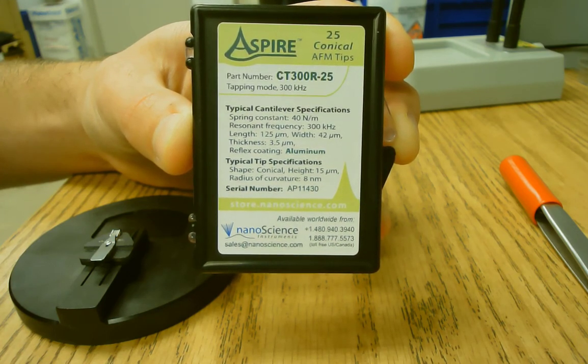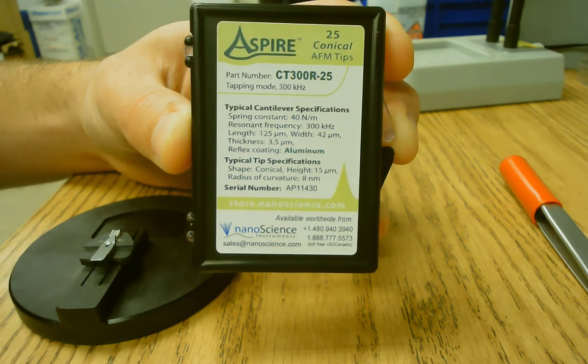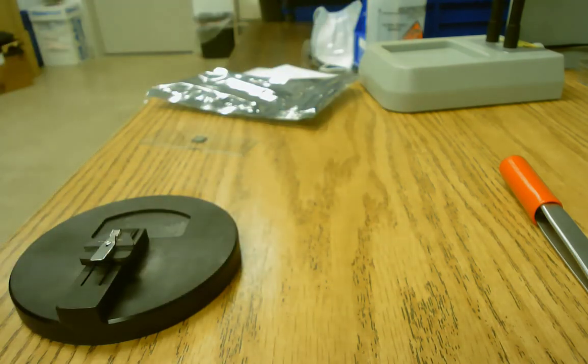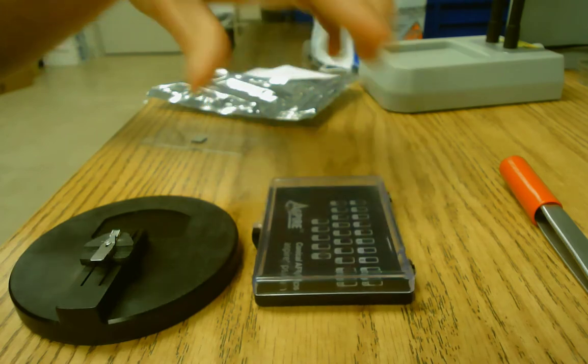And then these tips are specifically silicon nitride. There are just silicon tips as well. The silicon nitride tips are a bit harder and a bit better for general tapping mode of hard materials.